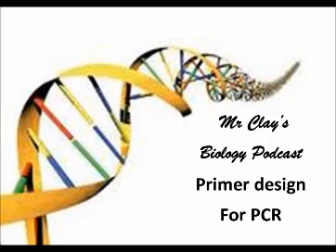This podcast is particularly focused for those people that are working on Mr. Clay's 13biology.wikispaces.com and are doing one of the primer design projects on there. I hope by now you have received your data and are ready to make some progress. The objective of this podcast is to help you refine a big long list of possible microsatellites and identify the ones that are most suitable for using in a PCR reaction. To do that, I'm going to discuss 6 criteria that you can use to reduce that list down.